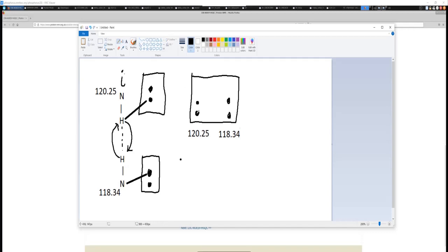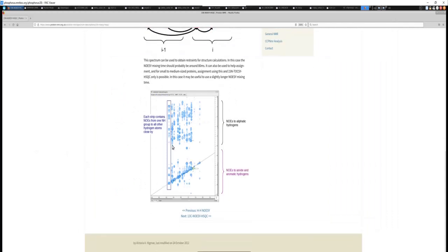And you'll notice that as you look at your NHSQC, there is a diagonal cross peak. And this box that you can form represents hydrogens that are nearby, that are seeing each other, that are close in contact with one another. So that's exactly what you can see here, right? You have this diagonal strip, and these are just different nitrogens. And each strip that you see correlates to what the hydrogen of that amide is looking at, what is nearby.